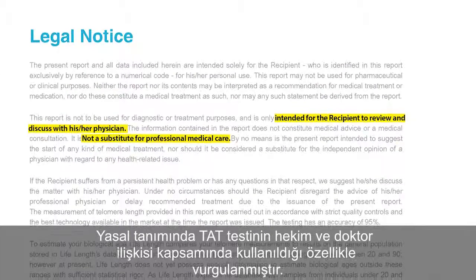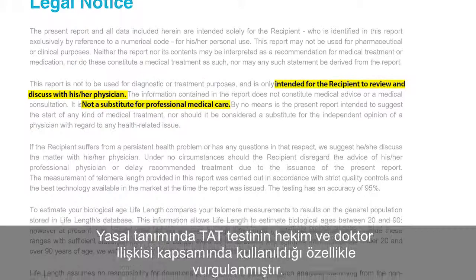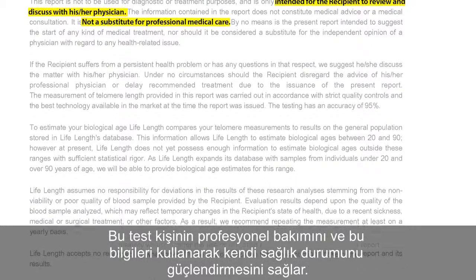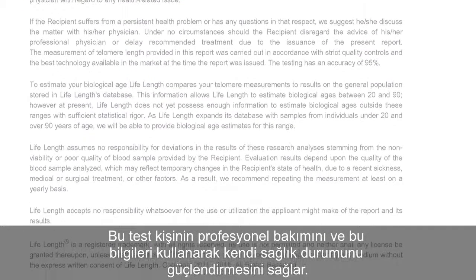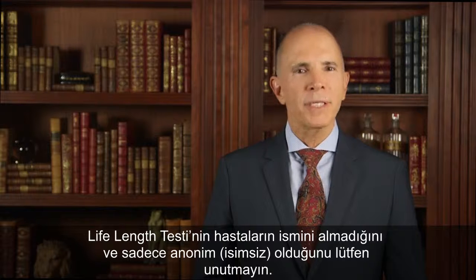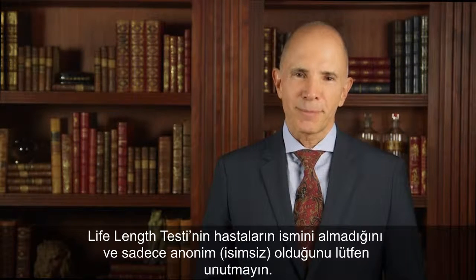The easiest way to go through the report with patients is to go page by page. The legal disclaimer essentially highlights that the TAT test is being used within the context of the physician-patient relationship. It reinforces both the primacy of your professional care and the importance of using this information within the context of the patient's unique health status. Please note that LifeLength has obtained and reported only anonymous data, and we do not have patients' names.